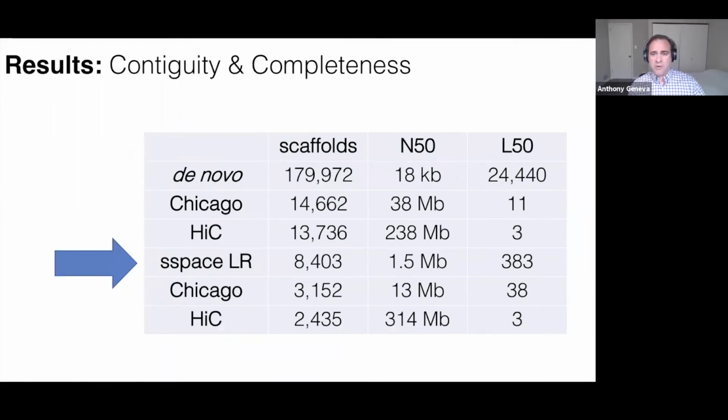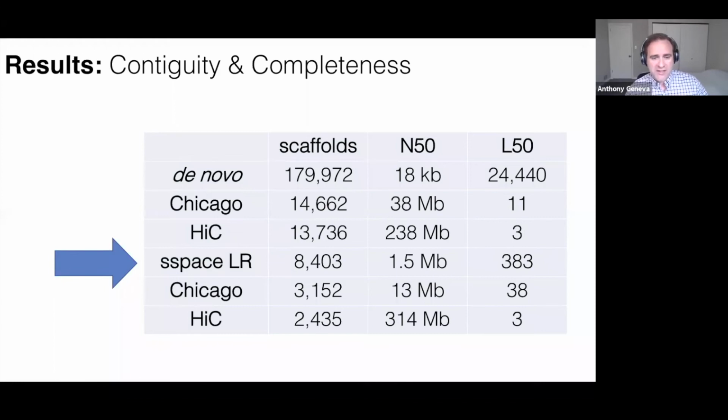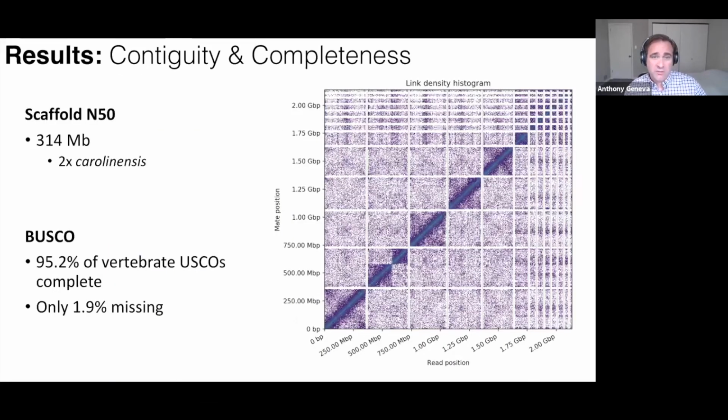At that point, we broke things up; we basically took any stretch of 100 Ns or more, rebroke those into contigs, and rescaffolded using PacBio data. Going back through Chicago and Hi-C, we ended up with a final assembly with an N50 of 314 megabases, highly, highly, highly contiguous for an anole. Twice what we were able to get with carolinensis for many millions of dollars.